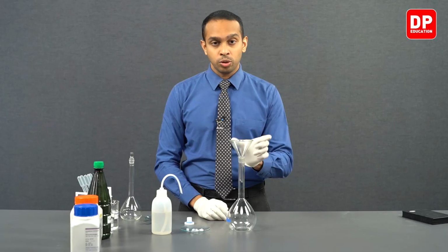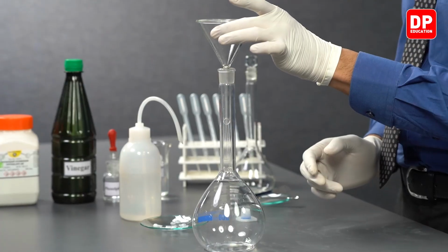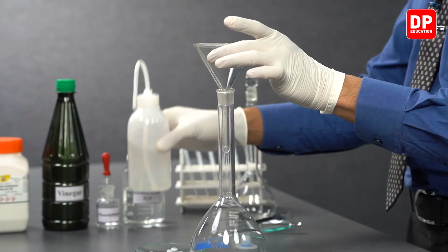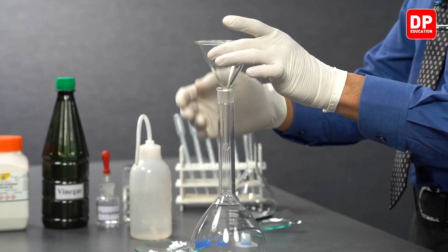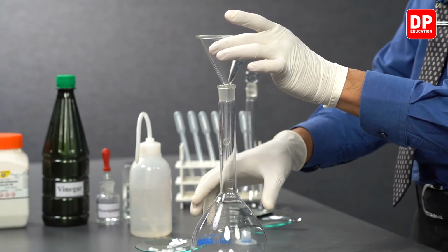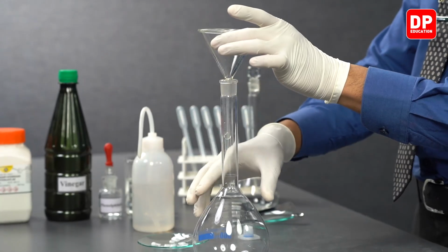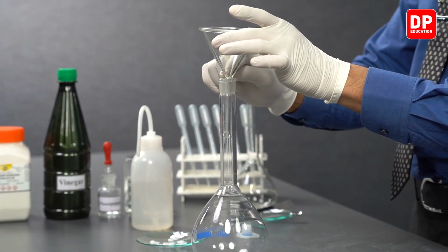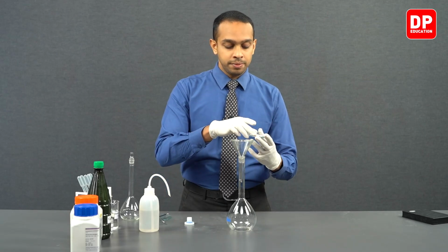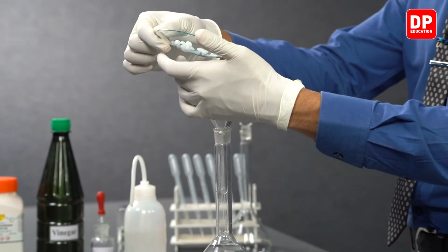To avoid that from happening, you can lift the funnel a little bit and then add your water, so that as the water is delivered into the volumetric flask with the help of the funnel, the air that is getting displaced has enough room to escape from the mouth of the volumetric flask. Let's take our sodium hydroxide pellets.